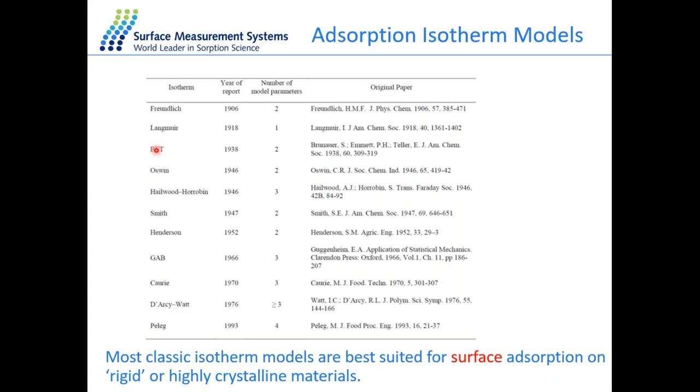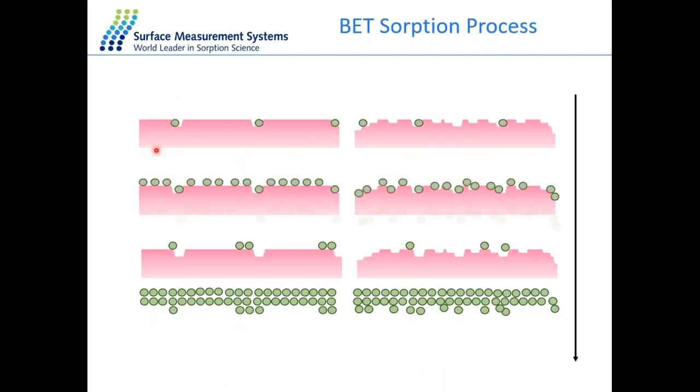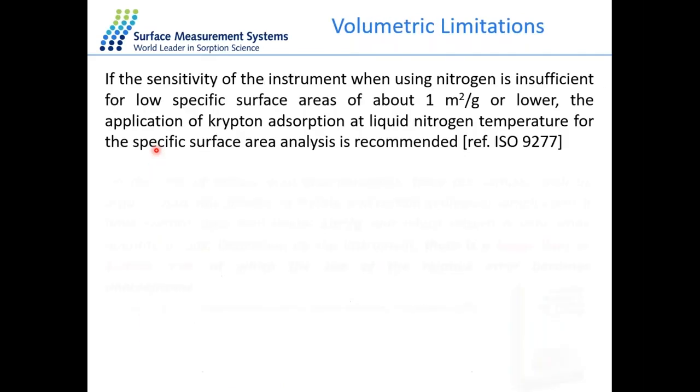Yeah. Another question here from Jorge Balmaceda, and he asks, when doing experiments with benzene at a certain relative humidity, do you use a ternary mixture of carrier gas, water vapor, and benzene? Well, in the inverse gas chromatography, let me just show you that.